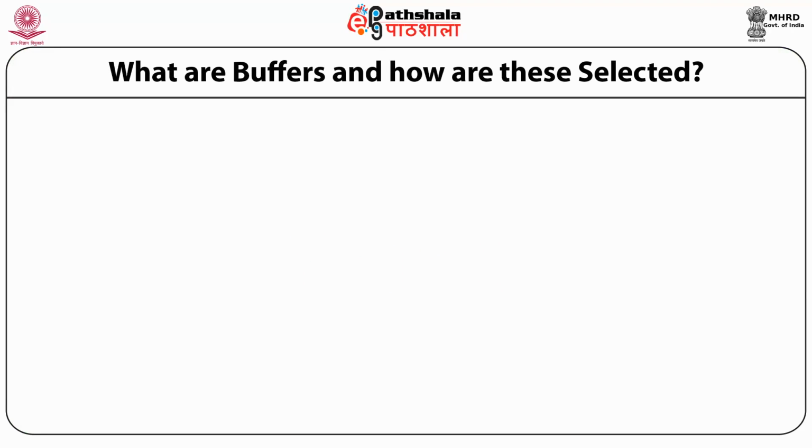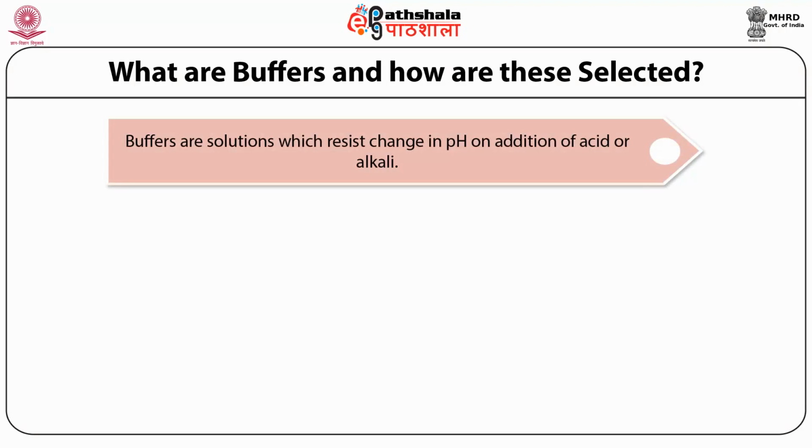In this slide, we will be explaining what buffers are and how these buffers are selected. Buffers are defined as solutions which resist change in pH on addition of acid or alkali.